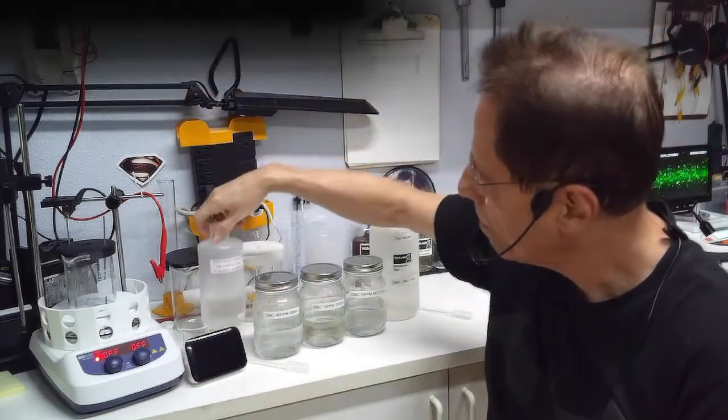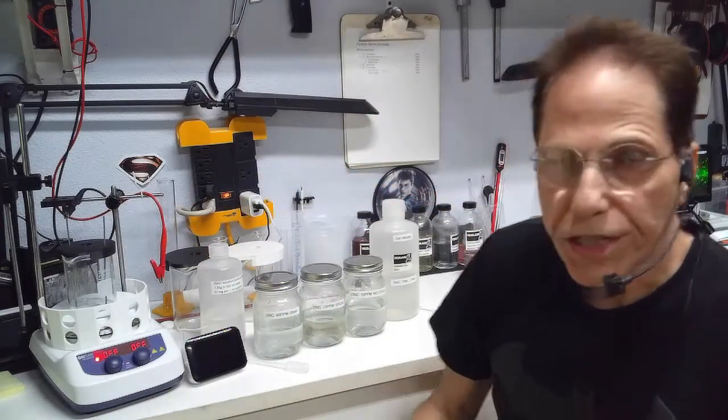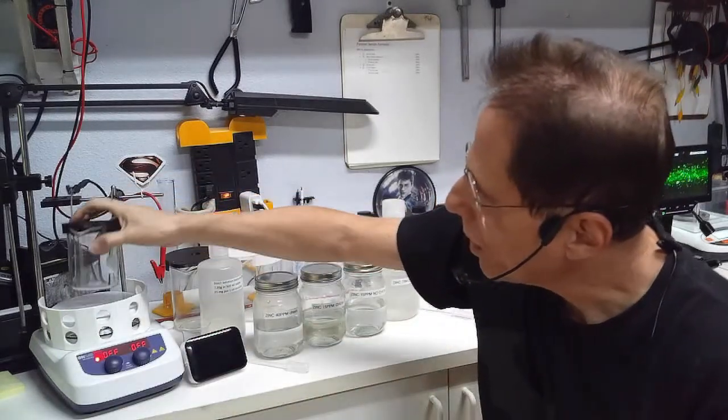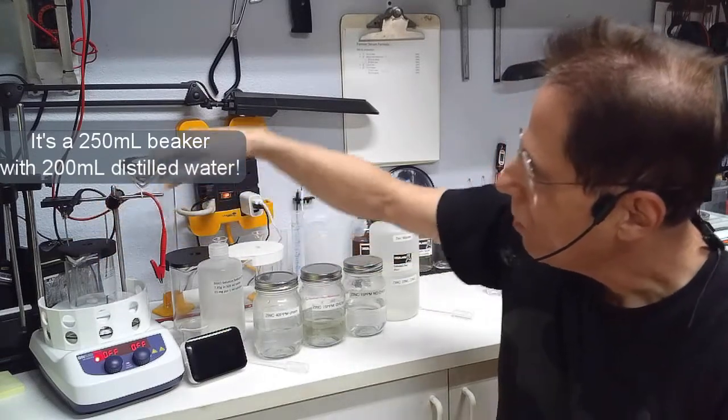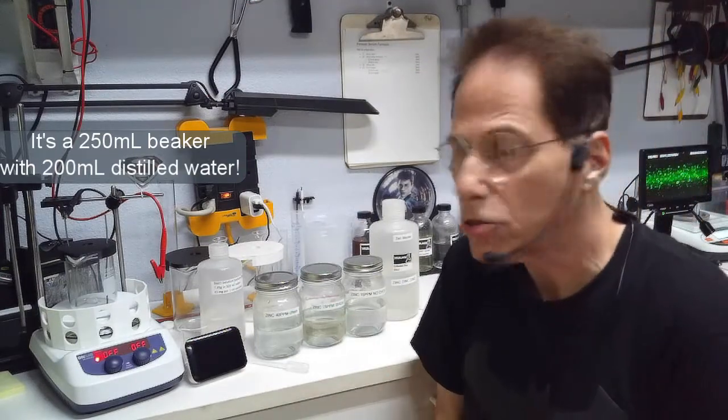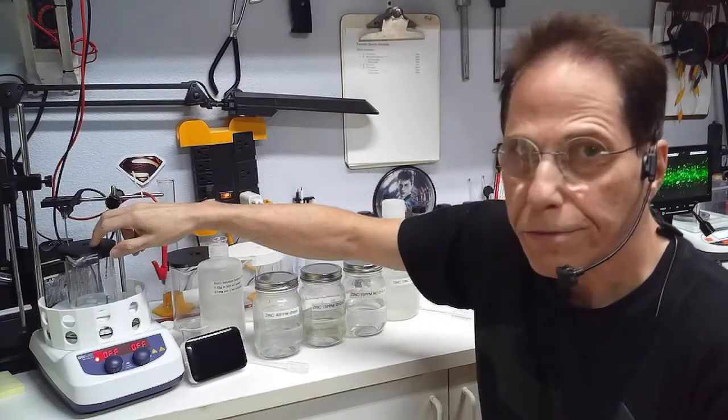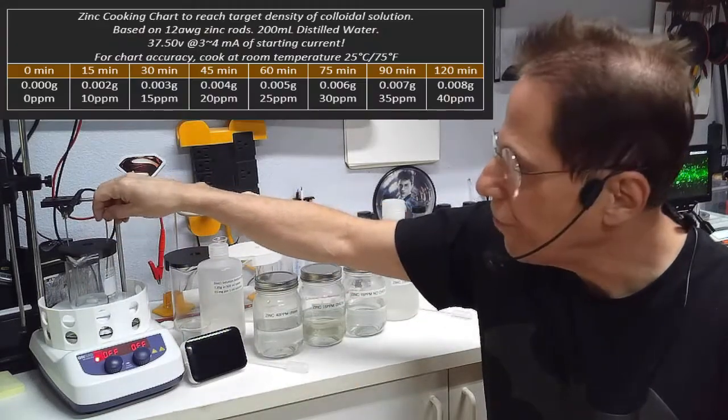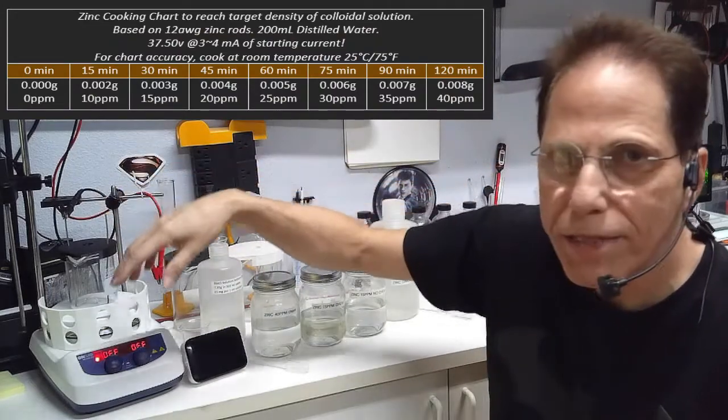This is what this looks like. This solution is going to be needed to make the colloidal zinc. So you're going to fill your beaker. Now this is a small beaker, 250 milliliters. The only reason I did that was because I have a whole lot of zinc here, really didn't need to cook too much zinc.